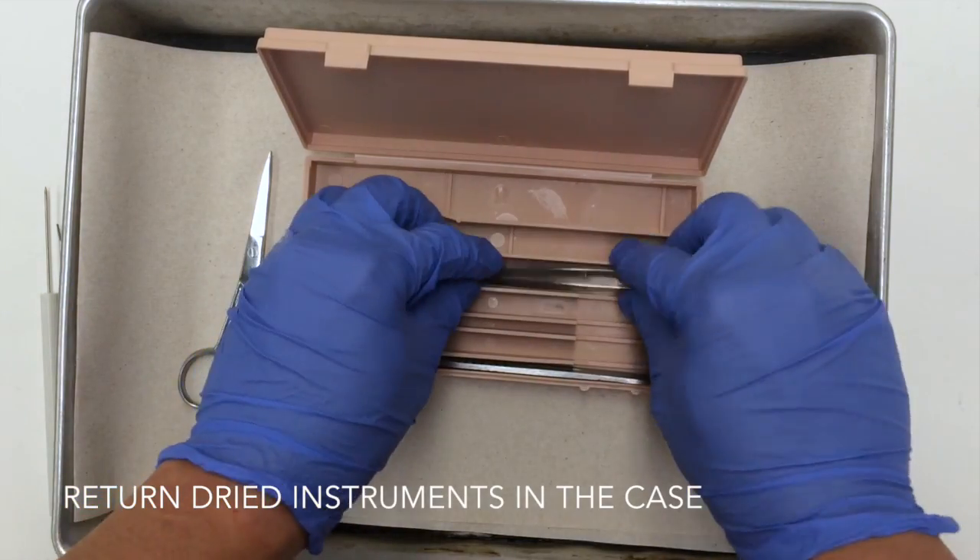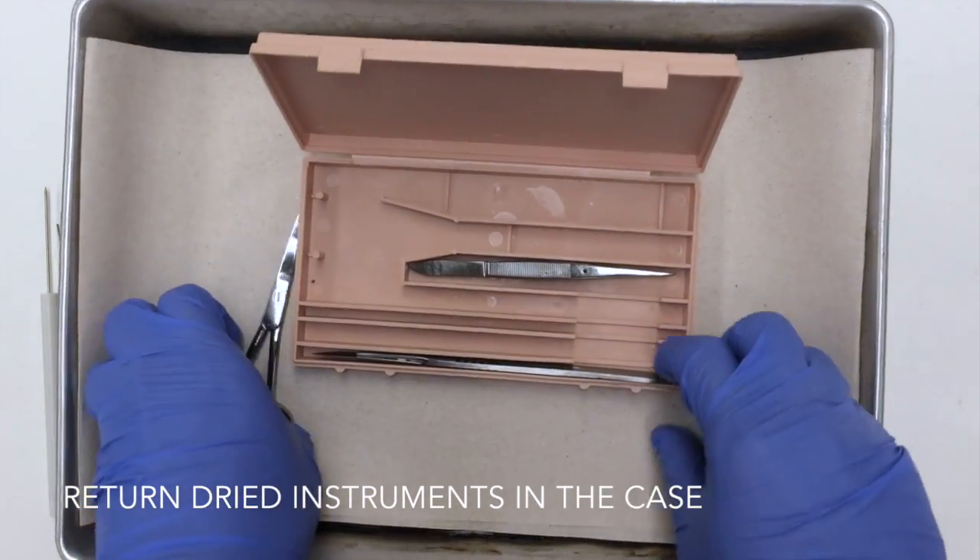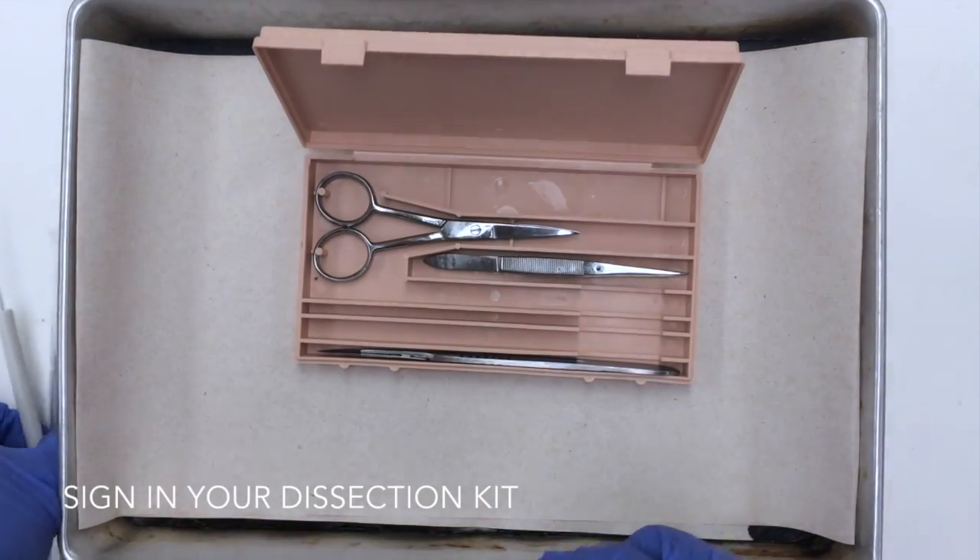Upon completion of your dissection, make sure you wash and dry the instruments, put them back in the case where you found them, and then sign them back in.